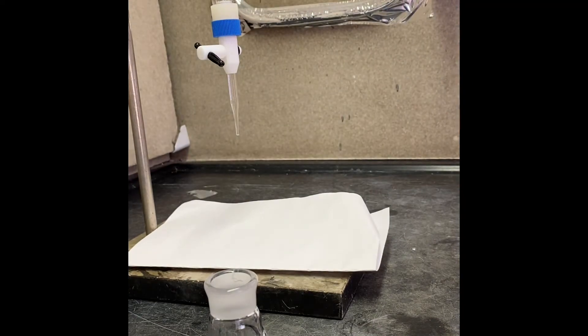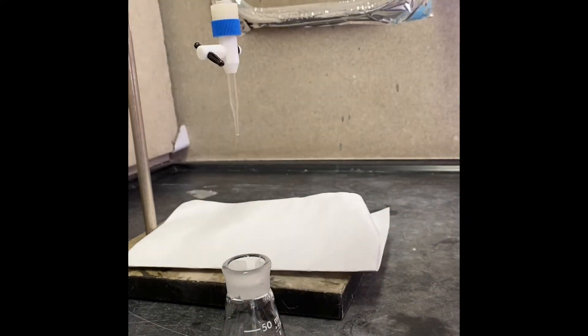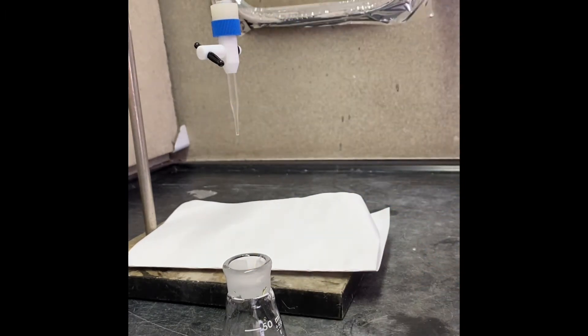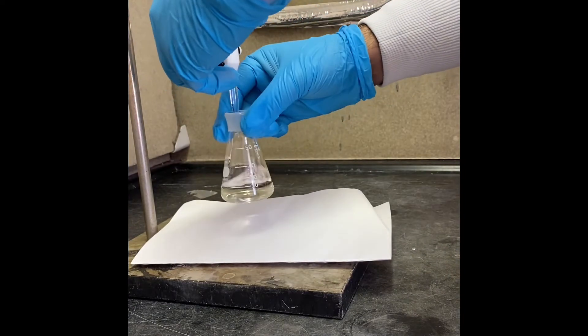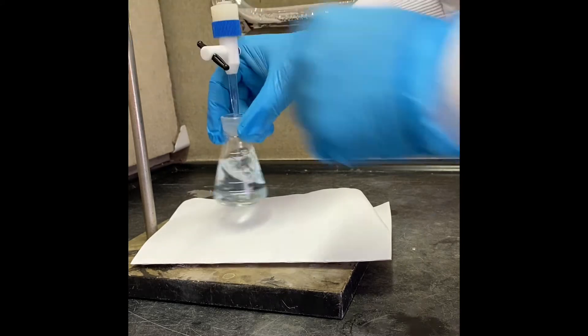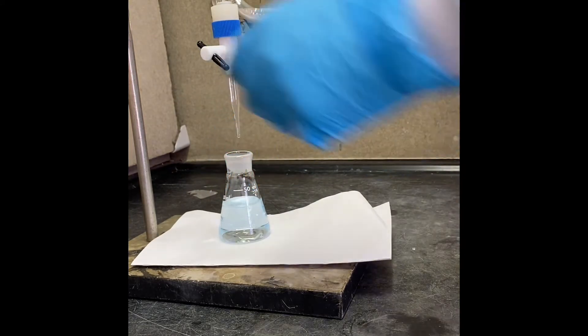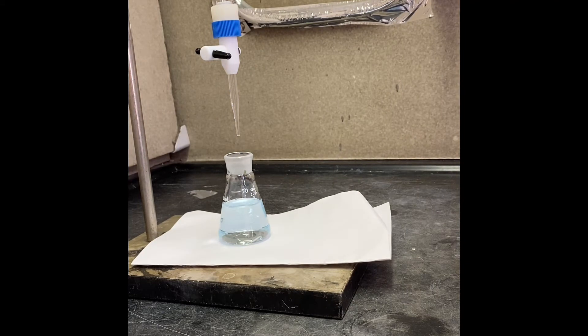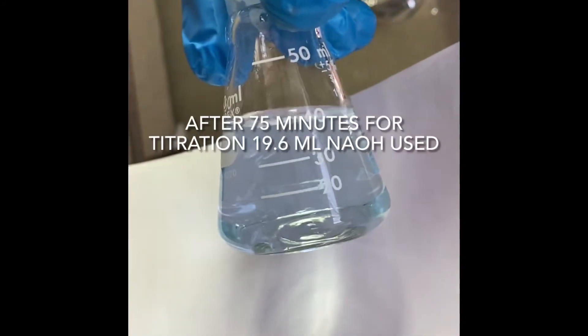Now we're preparing our 75-minute solution for the reaction start. That's 10 ml of acetone again with 10 ml of reaction mixture and some indicator. At initial it looks yellow. Let's see what we're going to get. All right, that's our 75-minute titration.